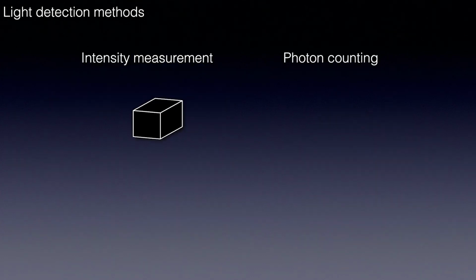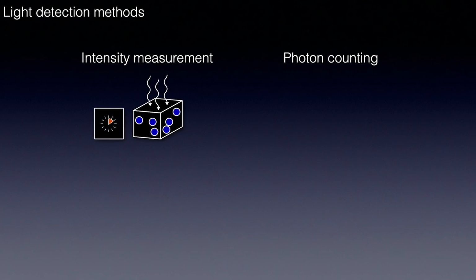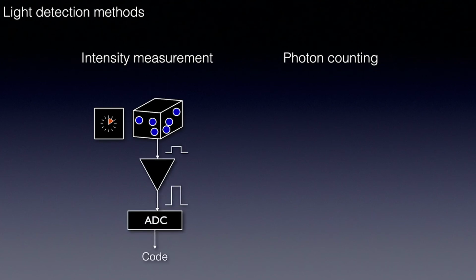To understand how this is possible, let's take a closer look at a single pixel of a CCD camera. What happens here is the following. We expose it to light for some time to get enough photoelectrons. Then we need to amplify the signal and feed it into an ADC to get the code. That code is believed to be related to the number of photons that hit the pixel.